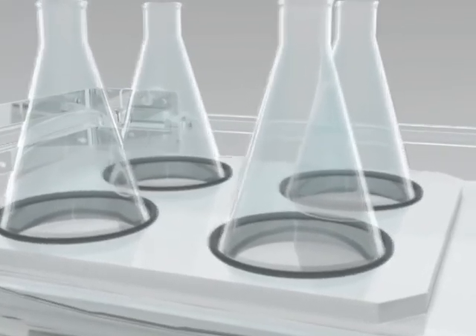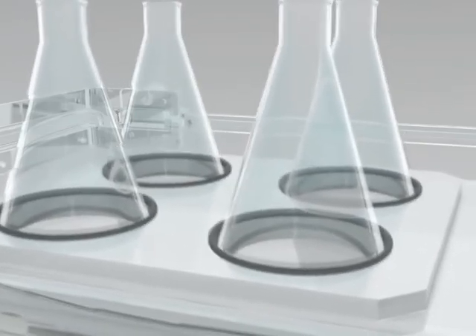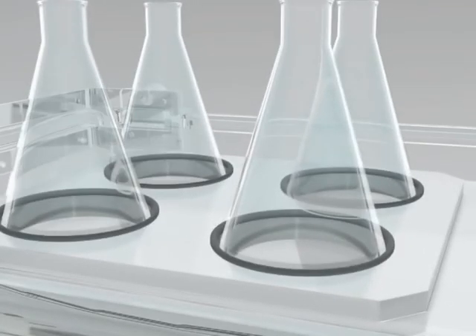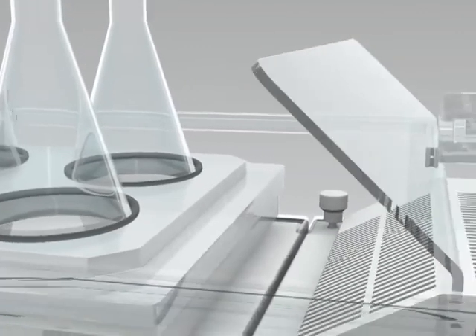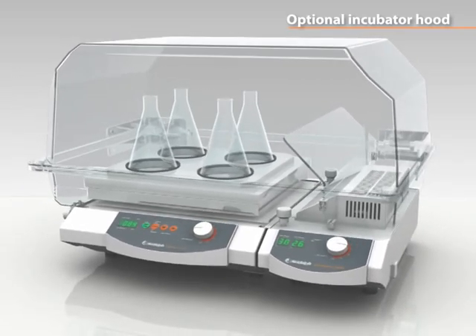Unlimited visual reaction control at all times. The transparent, non-fogging PETG material offers it all. Additionally, the electrical heater allows for quick and even temperature distribution throughout the entire enclosure.